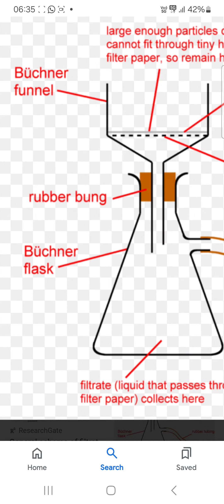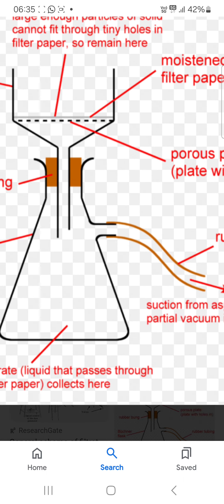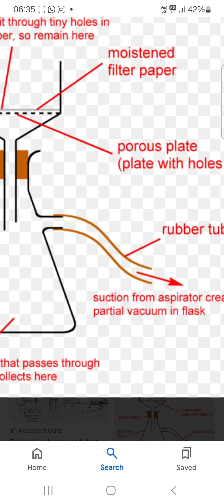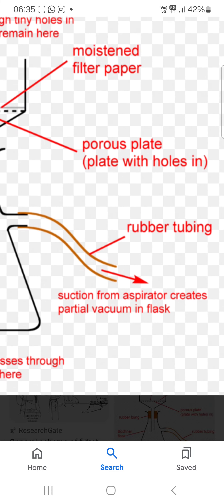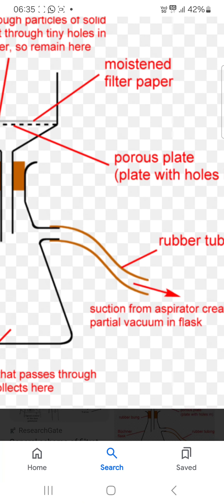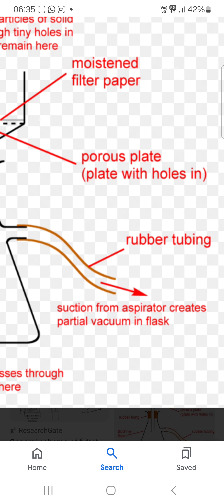You can see the rubber bung and Buchner flask. This is the Buchner flask. The suction from the aspirator creates a partial vacuum in the flask, and this is the rubber tubing.